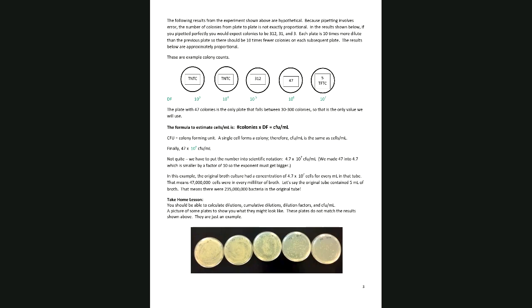So why do you think 25? Remember, we're getting more dilute as we go, right? And so each of these numbers differs by a factor of 10.